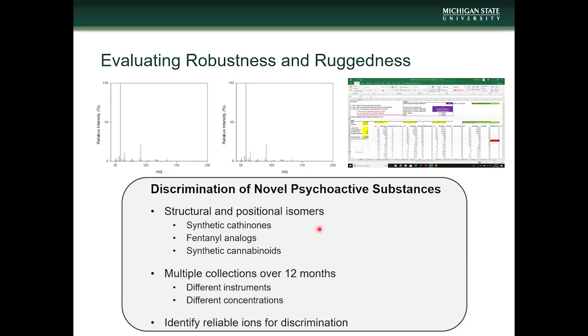And then the second instrument that we used was also an Agilent GCMS system, but it was in one of the teaching labs that we have here at MSU. So this was a more widely used instrument, still a well-maintained instrument, and we did not have a dedicated column in there. So in doing analysis on 2 different instruments, we were trying to just capture inherent instrumental variation that we might expect as we're collecting data on these instruments over time.